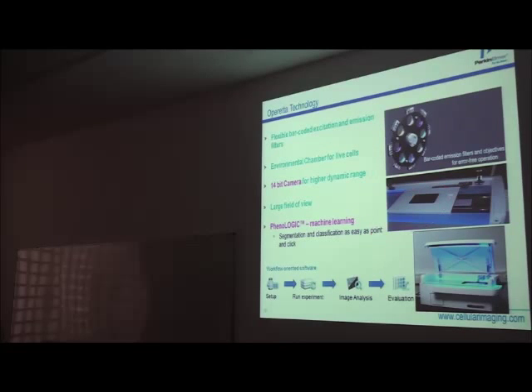There is a live cell chamber here for time-lapse acquisition. So if you want to repeat your measurement over time, you can control the CO2 and the temperature here. And then the system can just keep going. I've done a measurement for 4 days. It was fine. The software is called Harmony and has a very workflow-oriented design. So you can set up your measurement here, run it, do the image analysis, and then also look at the results of the analysis. And all is done in the same software.